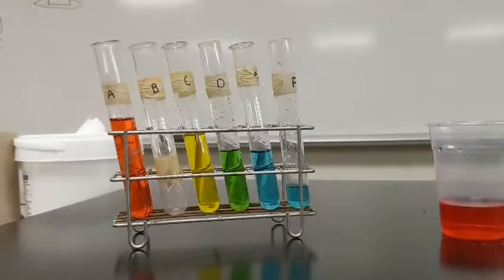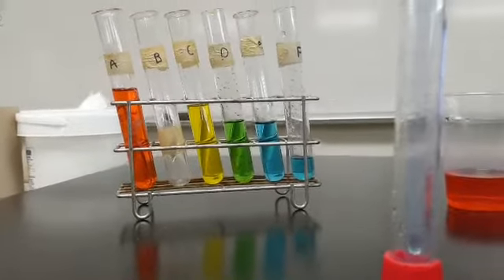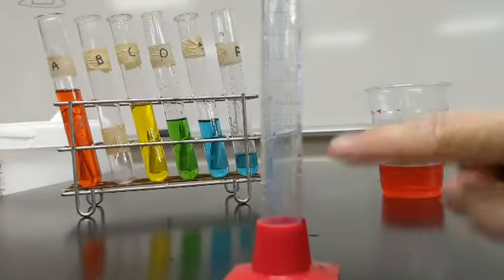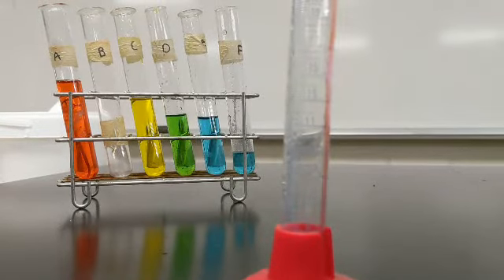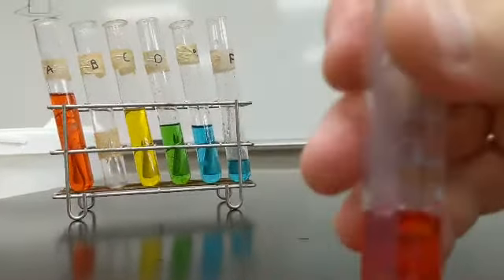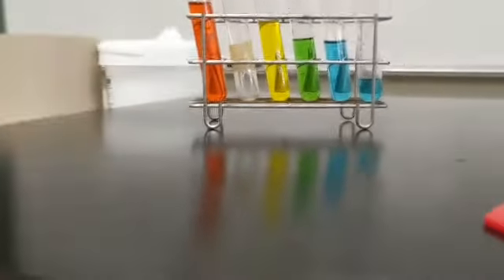Okay, now we're on step 7. It says from the beaker of red water, measure 7 milliliters and add it to test tube F. 7 milliliters. So we're going to try to get it to about right there. And again, I know you can't really see the numbers, and I apologize for that. I think you're getting the idea of this, though. All right, and I think I hit my mark. Yep, 7. And that goes into test tube F.